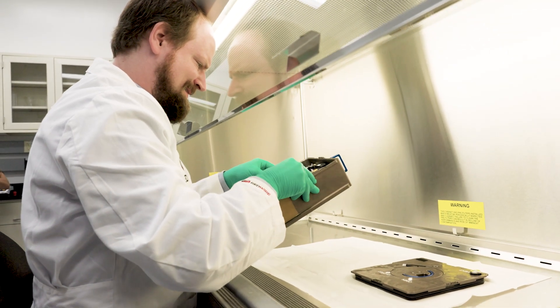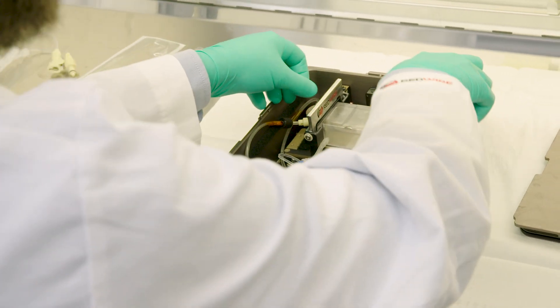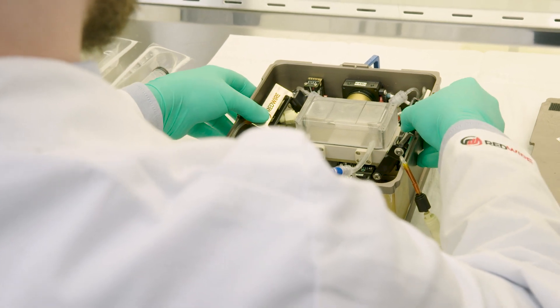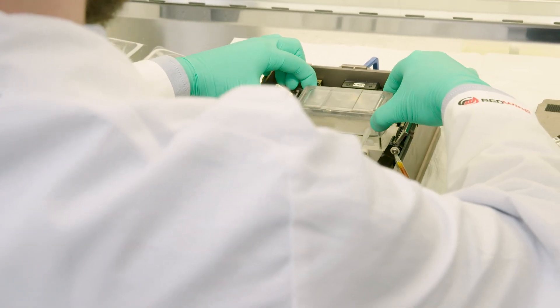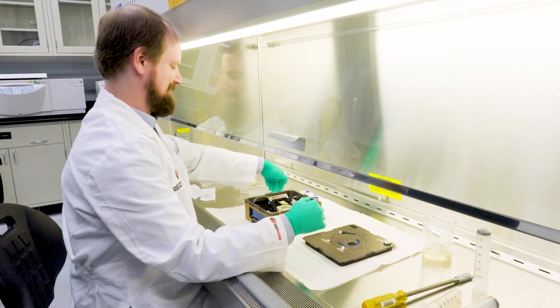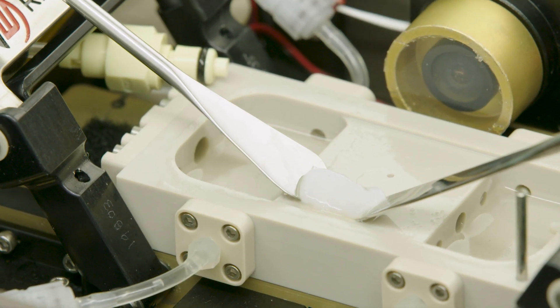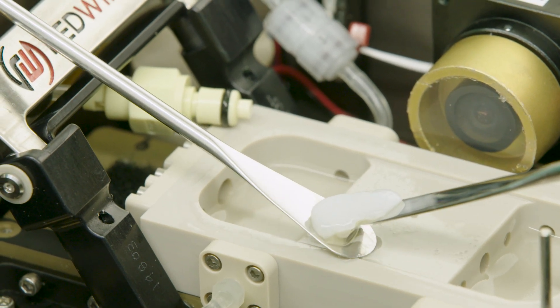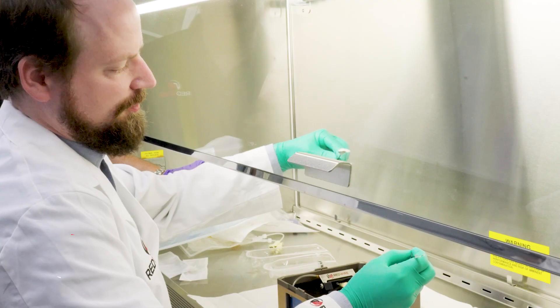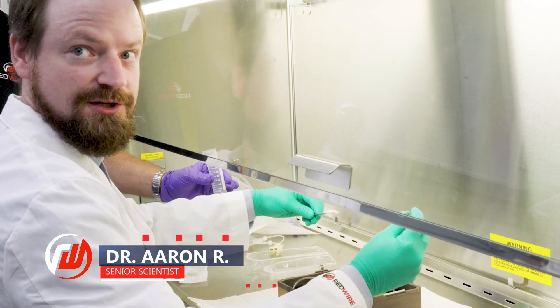There's something in there. There's our meniscus. That is your human meniscus right there. This is actually a good shot right here, where it's actually supported on its own, hanging off the side, so you can see it's definitely stiff like a tissue should be.